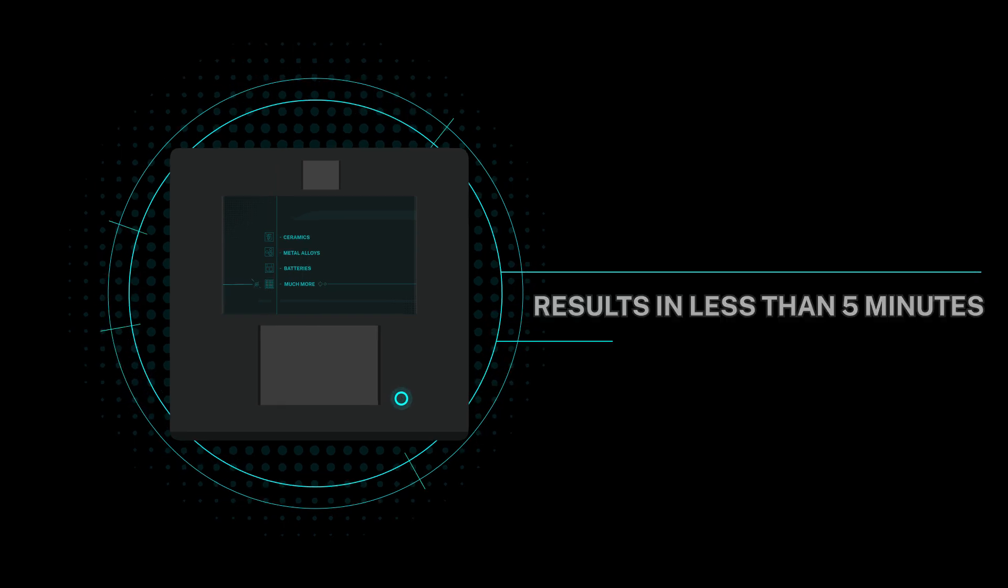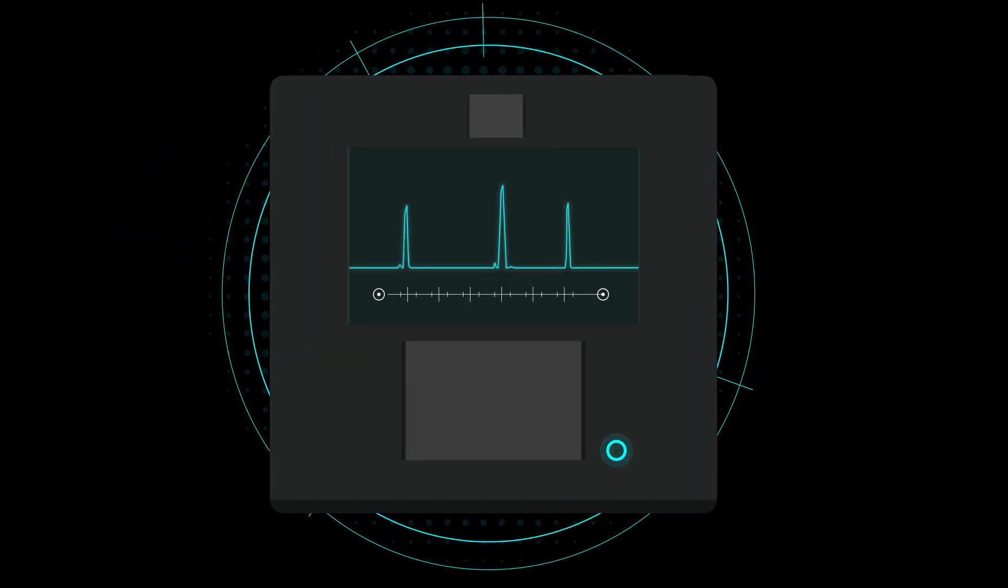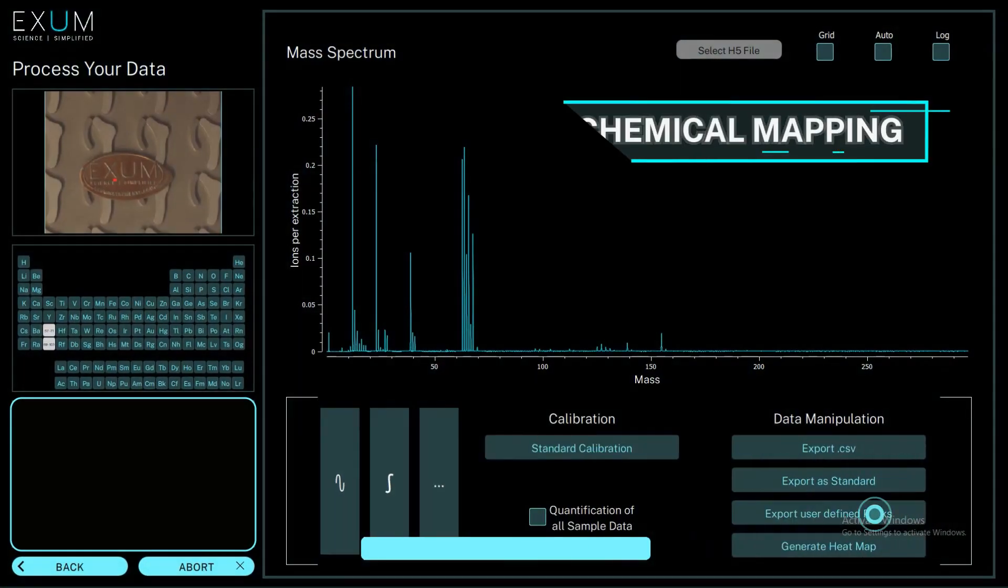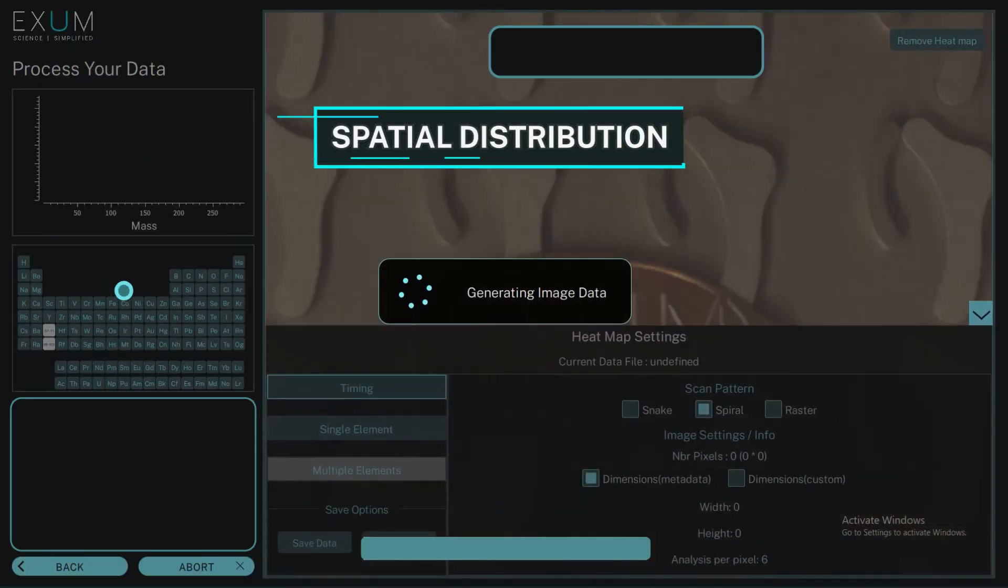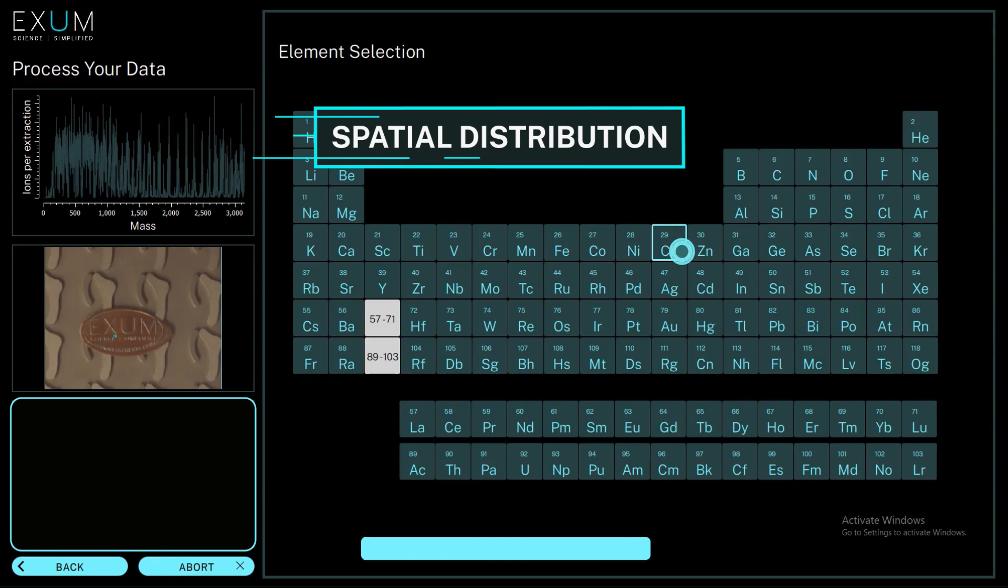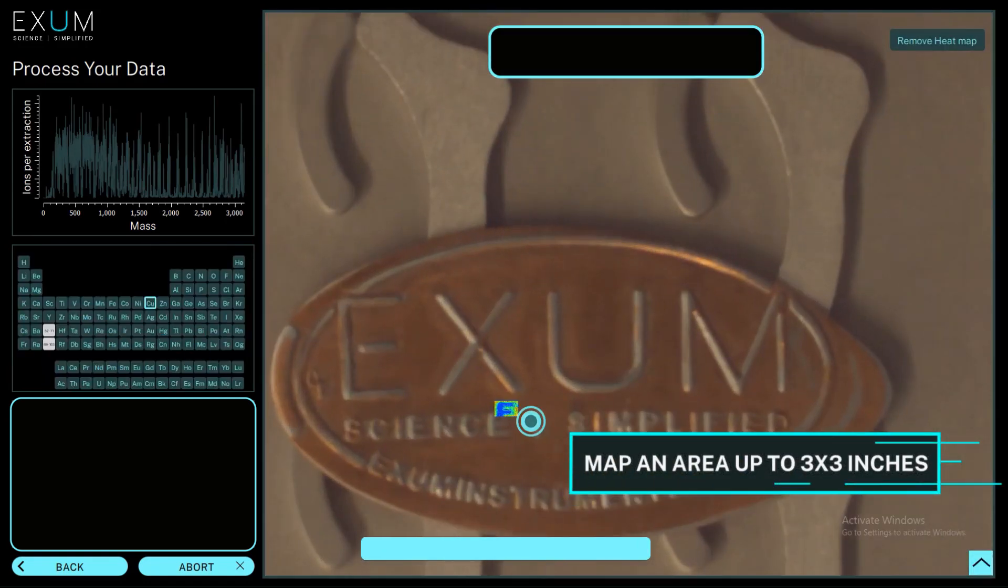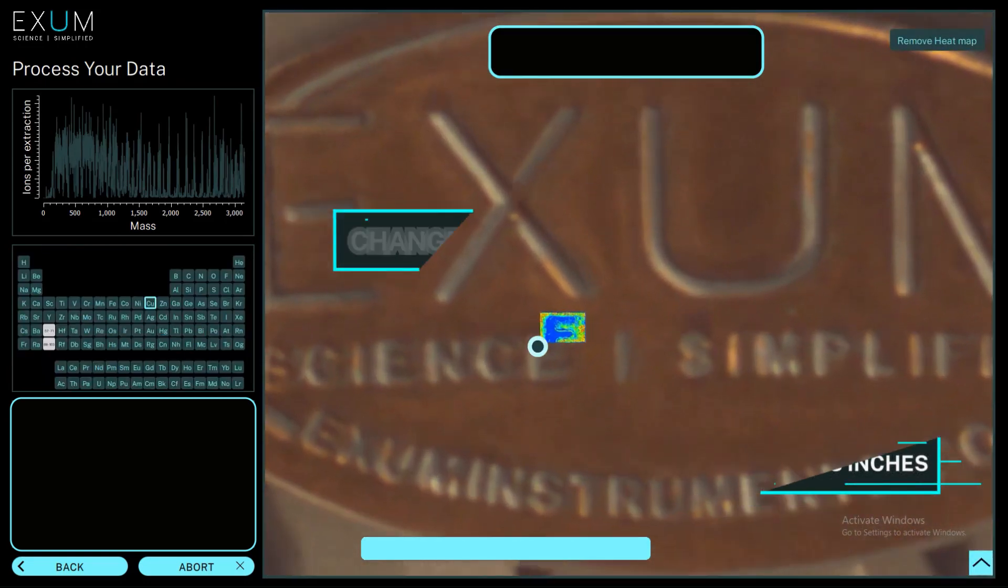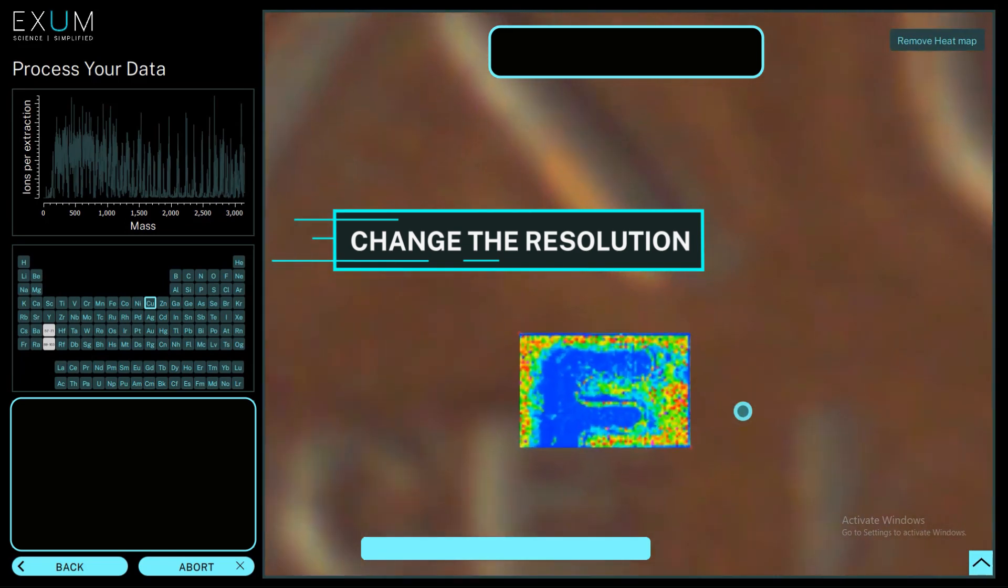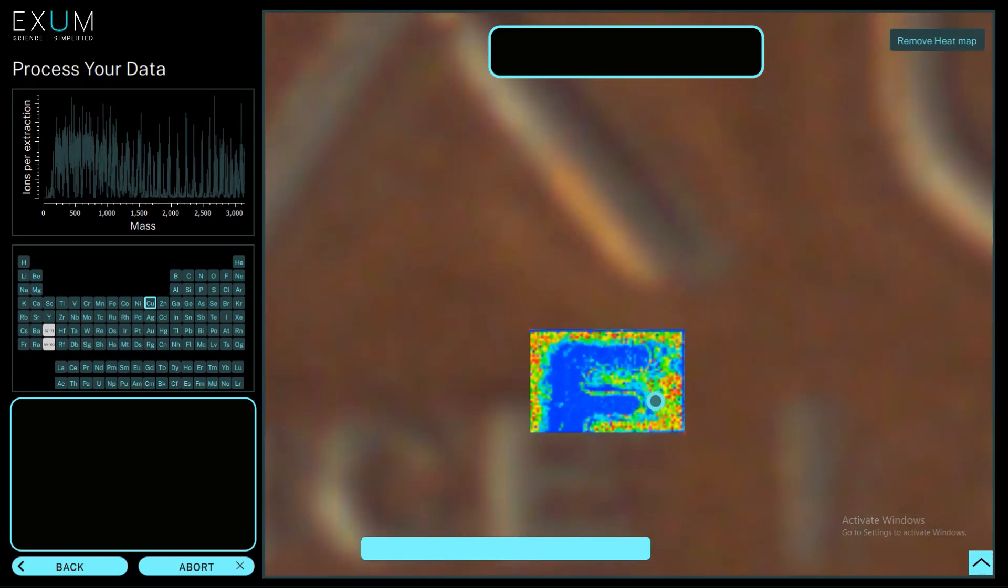Not only does MassBox provide bulk analysis of your sample's chemical components, it also offers chemical mapping, showing the spatial distribution of any element of interest. Map an area up to 3 inches by 3 inches and change the resolution by varying the laser spot size from 1 to 200 microns.